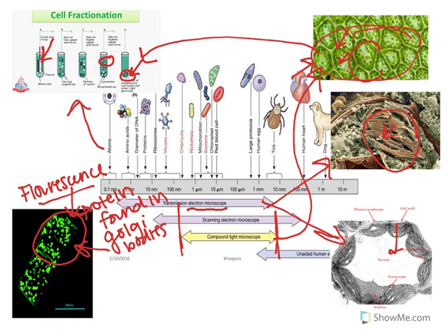What scientists found out by looking at this image is that the pieces of the Golgi body are glowing, but we also see the cell membrane. We see the outline of the cell membrane. That leads the scientists to believe that the Golgi has some kind of function with the cell membrane, because we put a tag on a protein in a Golgi body, and we are also seeing that that protein is in the cell membrane. So the Golgi body has to produce that protein. It has to be part of producing and forming the cell membrane.